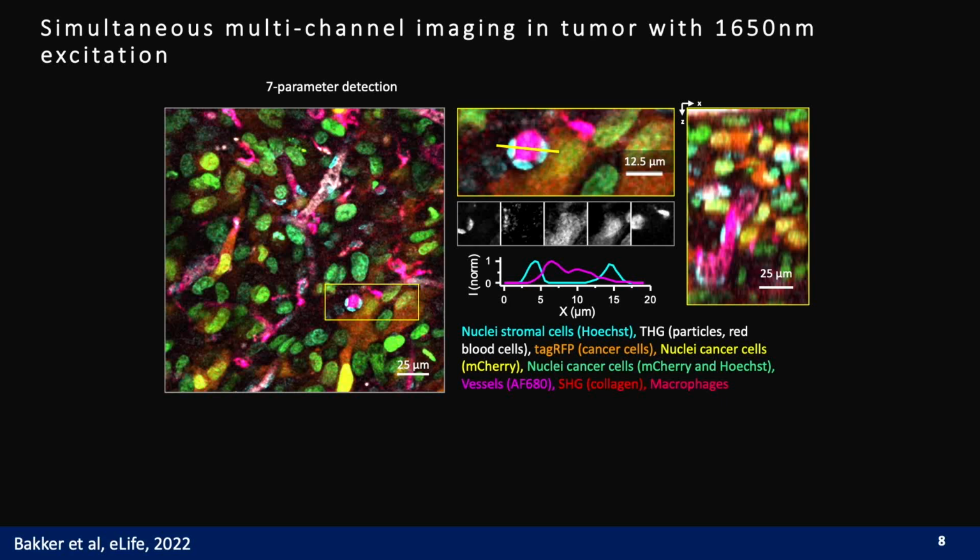So this demonstrates the 3 and 4 photon excited fluorescence along with the second and the third harmonic generation signals were able to be captured at the same time using one single laser excitation, the 1650 nanometers in this case. So it resulted in a 6-channel image in a single scan, and this avoids the chromatic aberration from imperfect laser alignment, which is a common issue in multi-beam imaging.